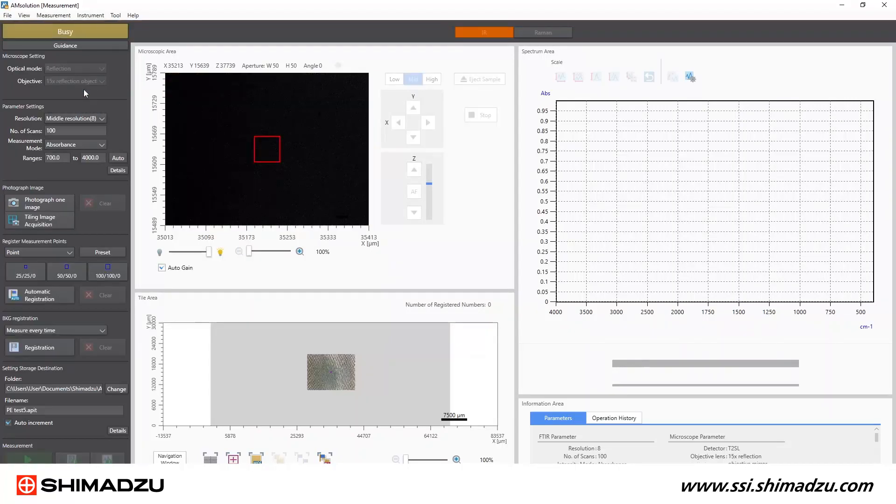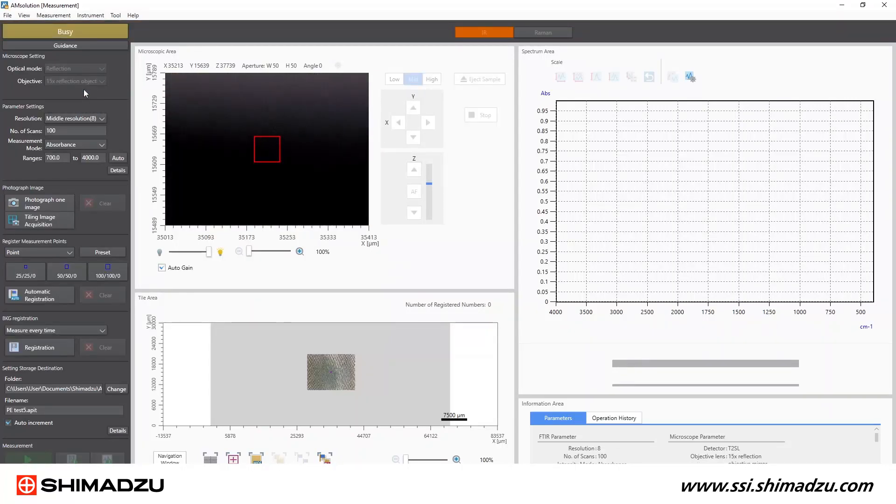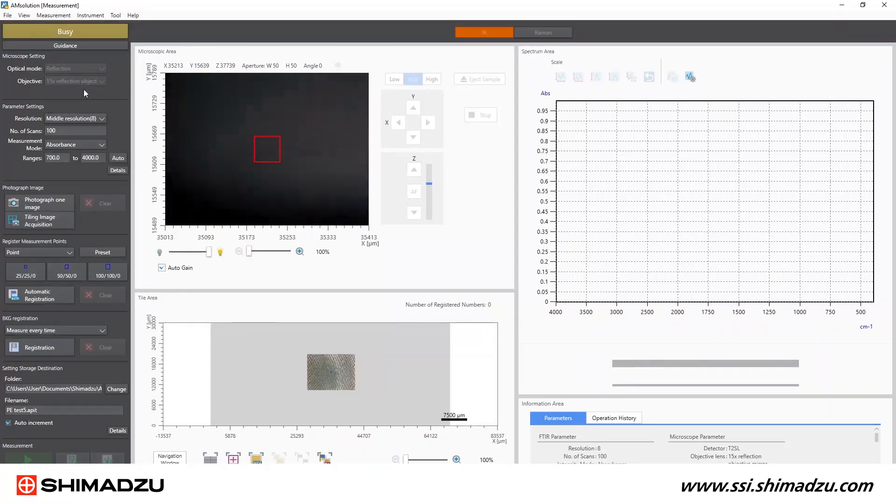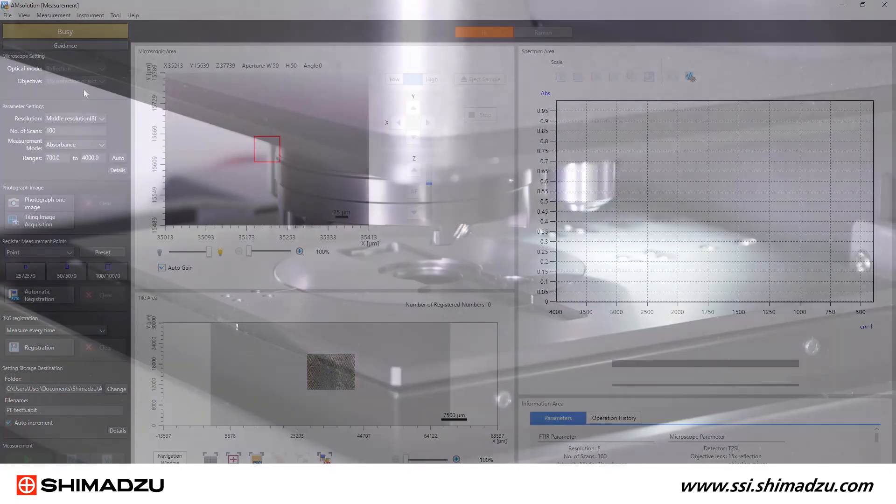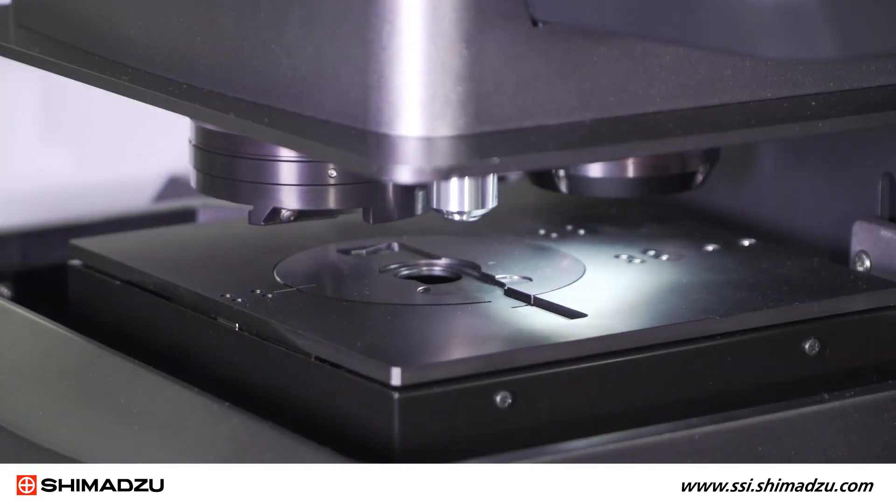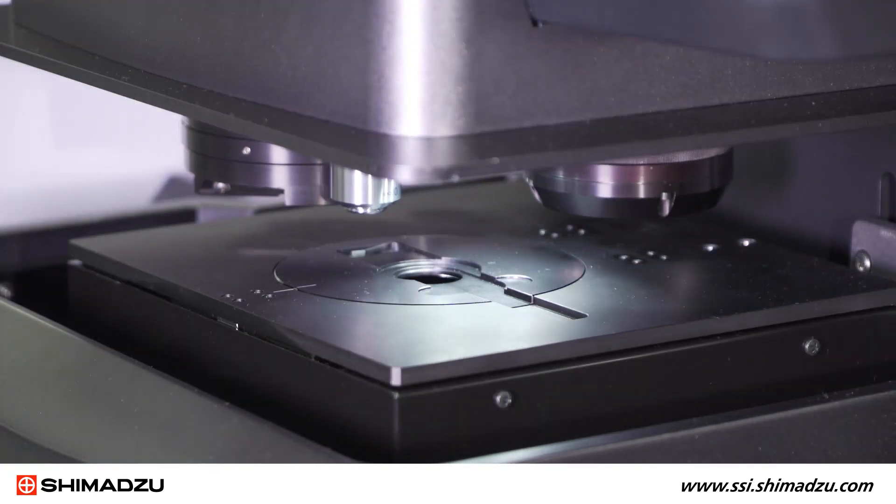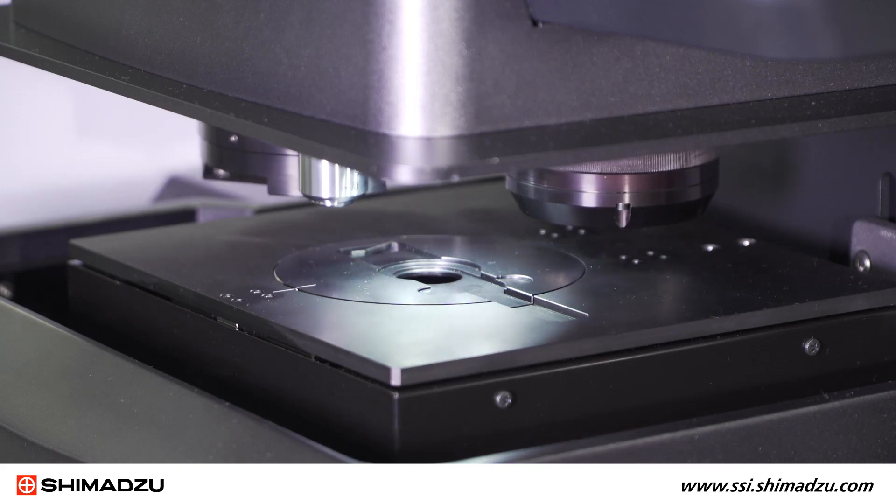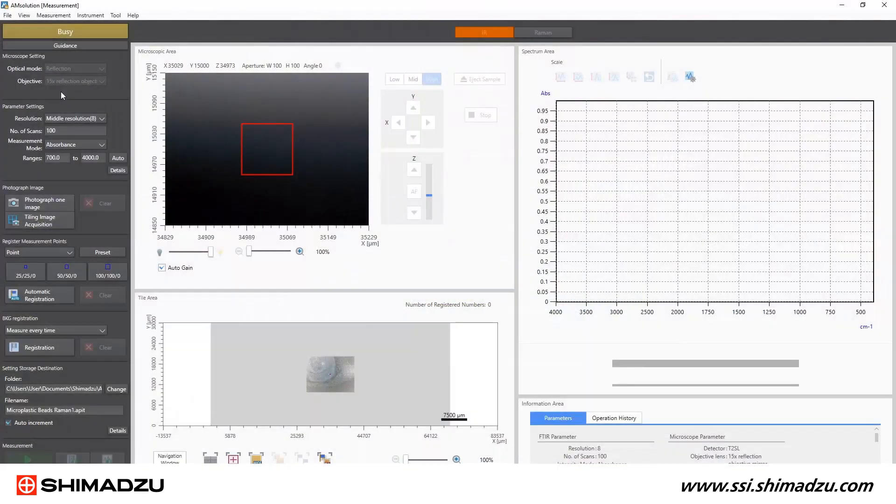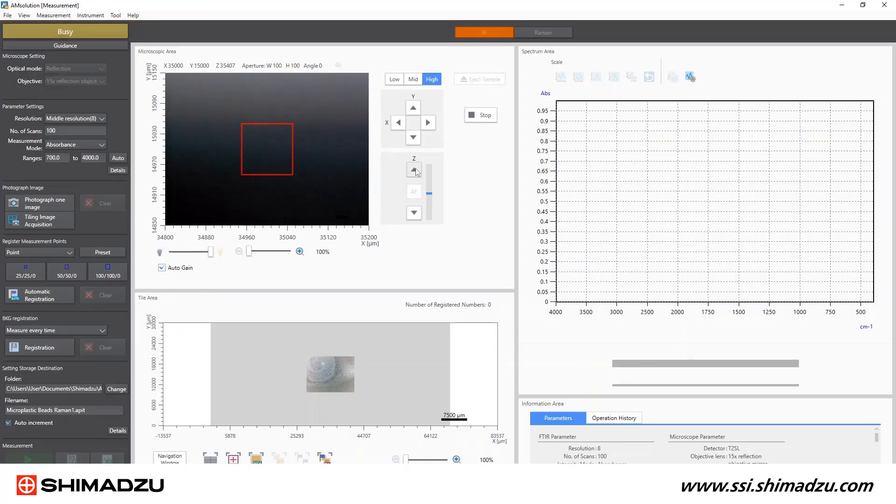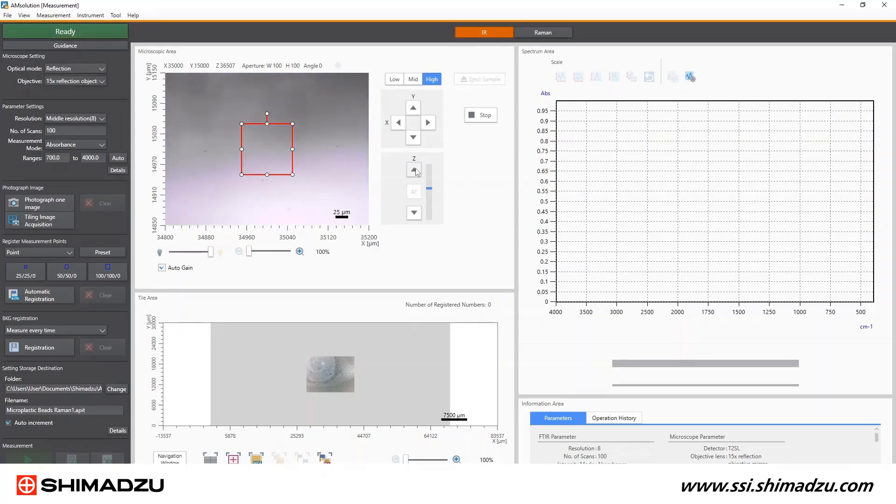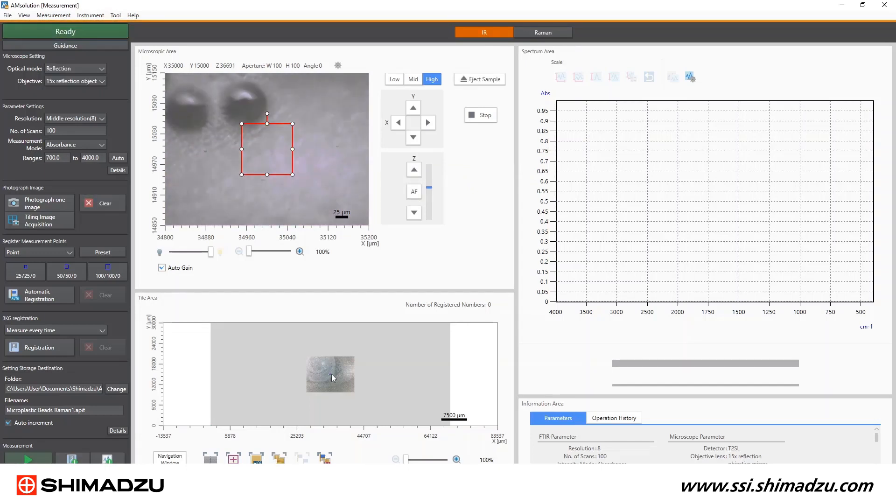With the wide field image saved as a reference, I'll go back to the objectives dropdown list and select 15 times reflection objective from that dropdown list. The objectives above the sample are now revolving to bring the 15 times magnification camera and the IR beam into use. Slight adjustment of the Z height is needed to refocus to the focal point of this new camera, and the X and Y positions of the camera overlap perfectly, but the Z height focus differs slightly.